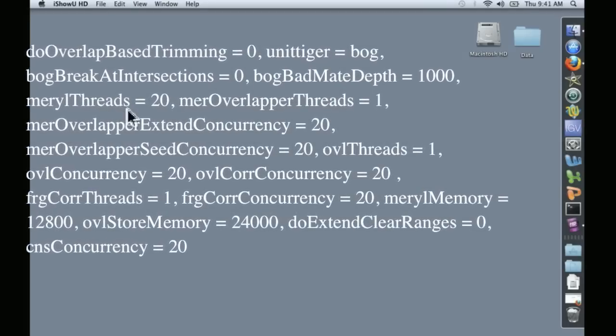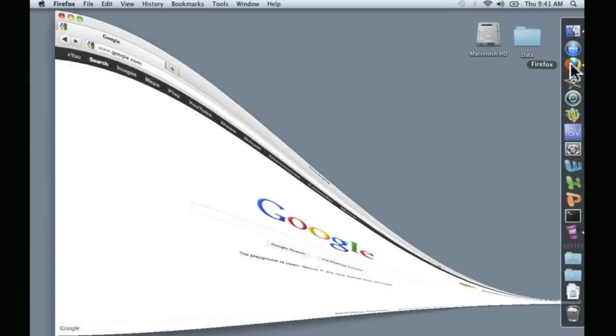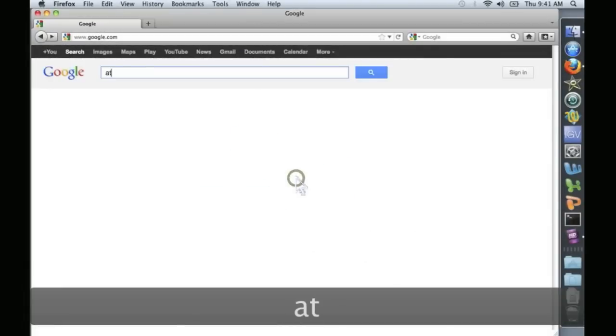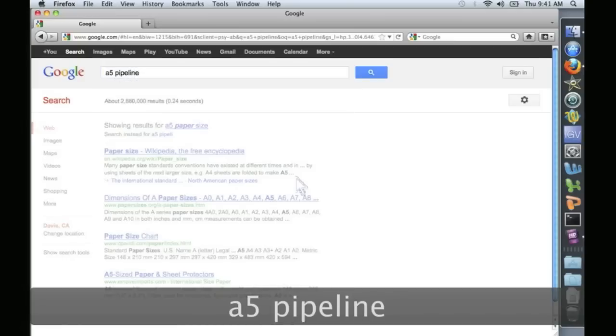To begin, let's download the A5 pipeline. Open any browser and just type A5 pipeline.